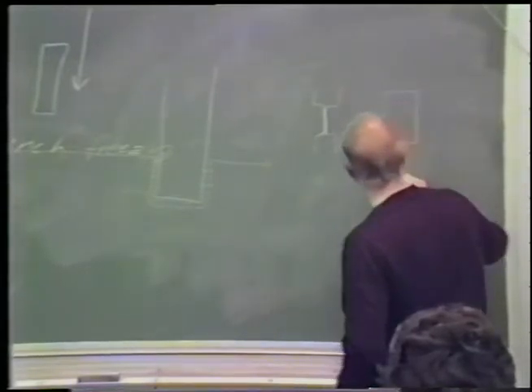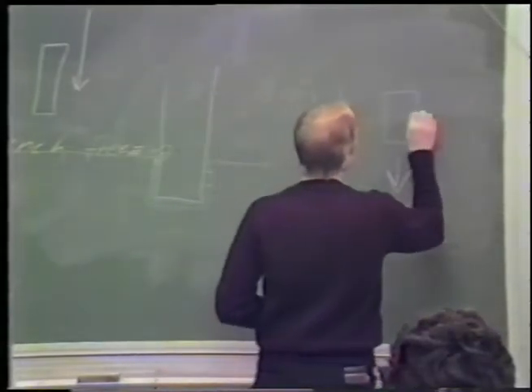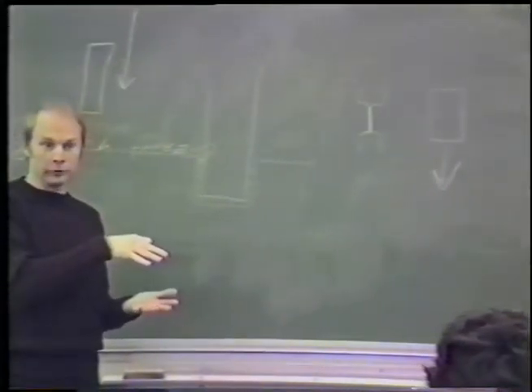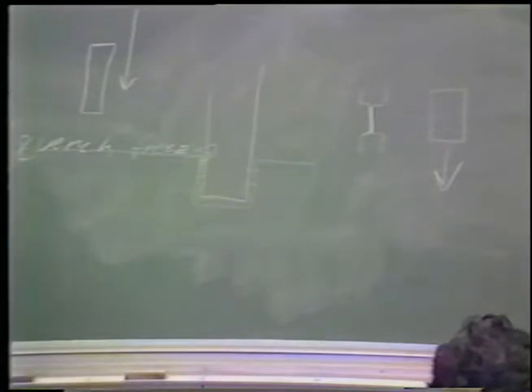And they would move into the cryogen this way. And this section would be through here. It would be two pieces of metal, one sandwiched on top of the other, the sample in between. Is that clear?